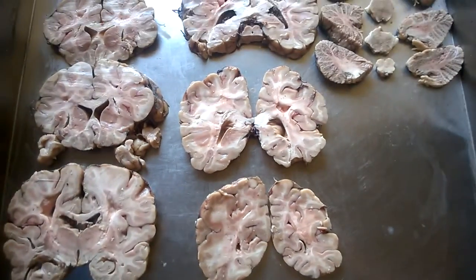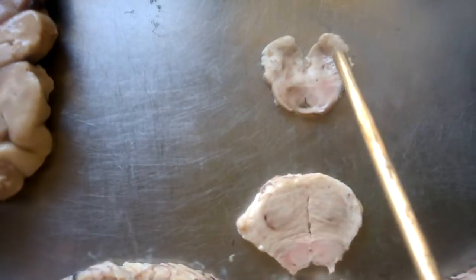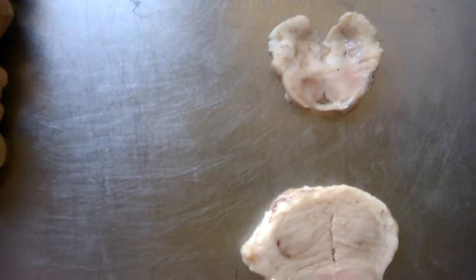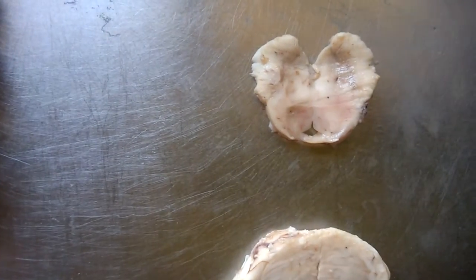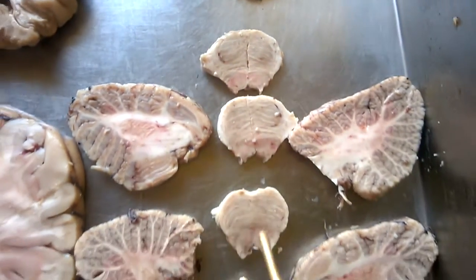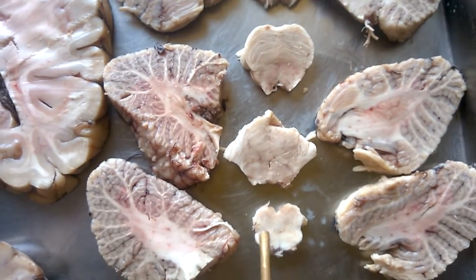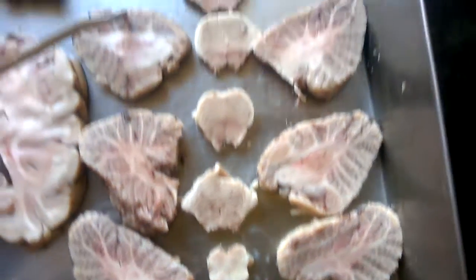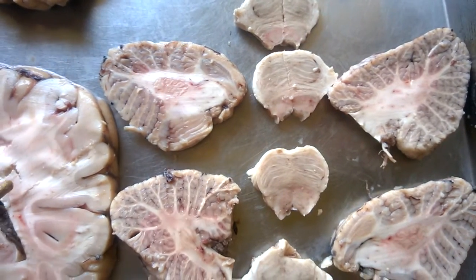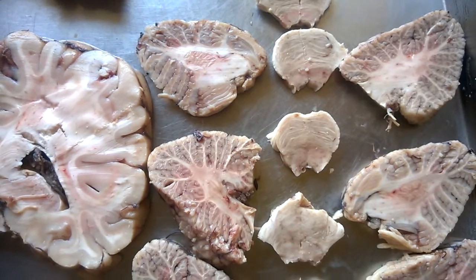Then we can take a bit from the midbrain. In case of Parkinson's disease, the substantia nigra won't be seen like this; the pigmentation will be grossly decreased. Then take sections from the pons, then from the medulla, and also a section from the cerebellum, which includes the cortex of the cerebellum as well as part of the dentate nucleus. Okay, that's it.